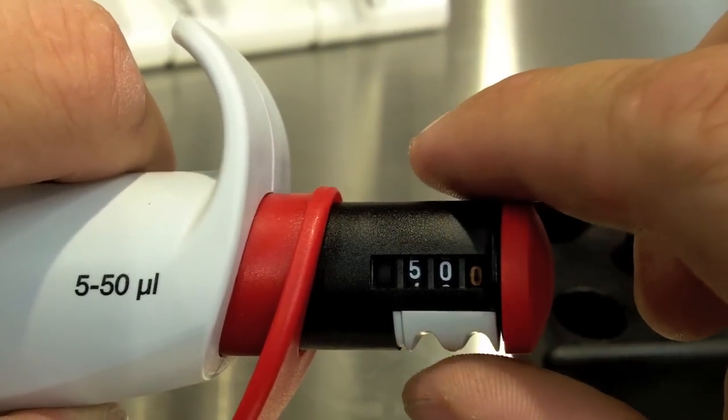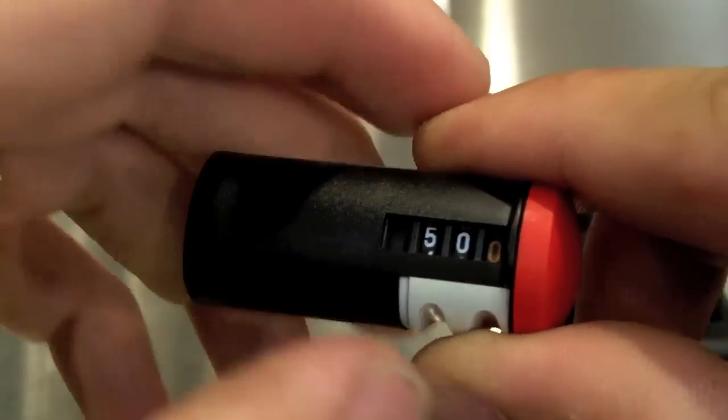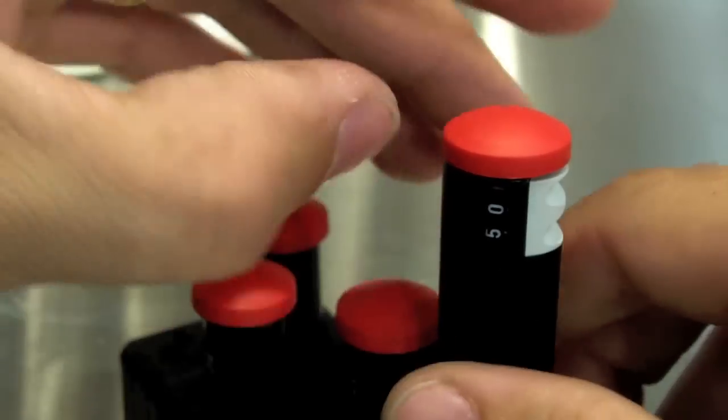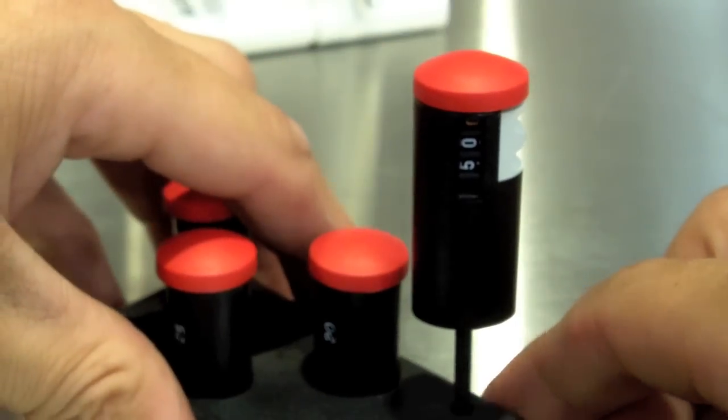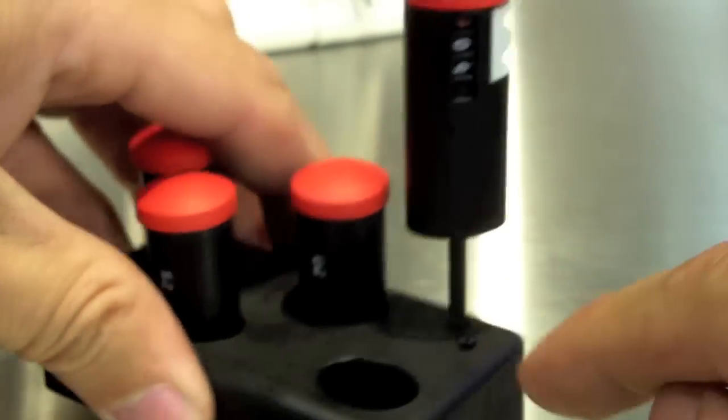Instead of sending this off to be calibrated, you simply remove the control knob, unlock the pipette, and place the control knob on the supplied allen wrench which goes in the holder.